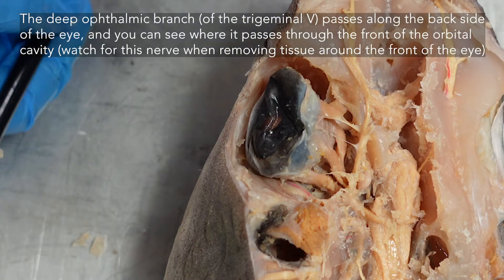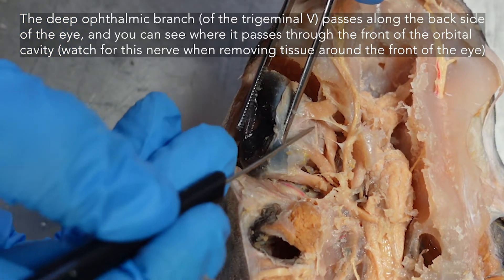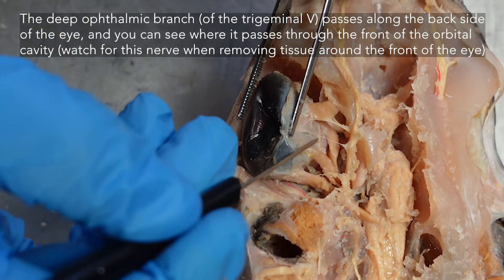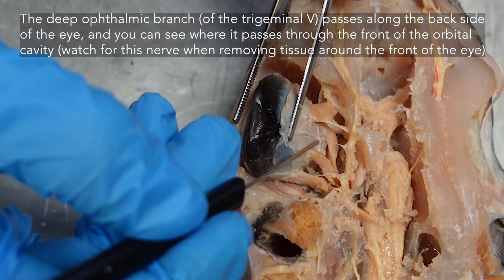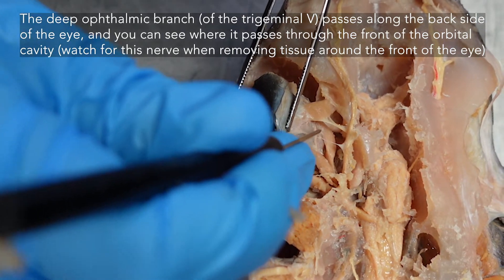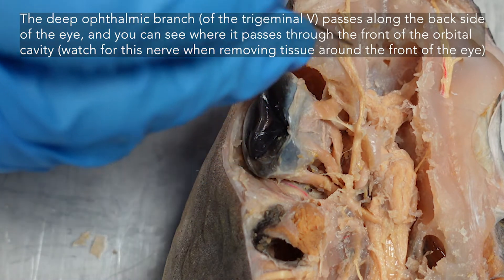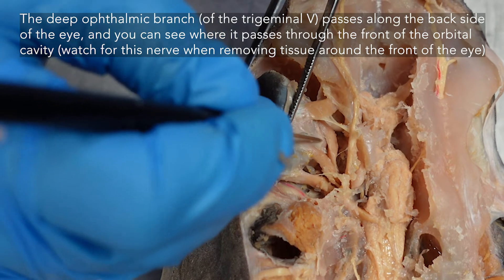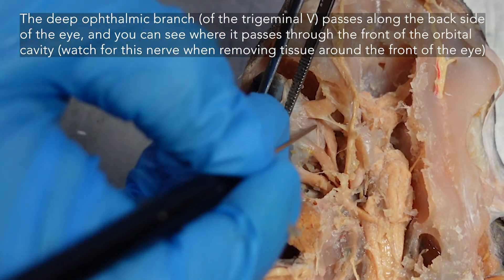As you're cleaning the top of your eye, you will see a small nerve running across the back, kind of parallel to your superficial ophthalmic trunk. This is your deep ophthalmic nerve — specifically the deep ophthalmic branch of the trigeminal. Your superficial ophthalmic trunk contains fibers from cranial nerves five and seven, whereas the deep ophthalmic trunk contains fibers only from nerve five, the trigeminal. You can actually separate that a little bit from the connective tissue.